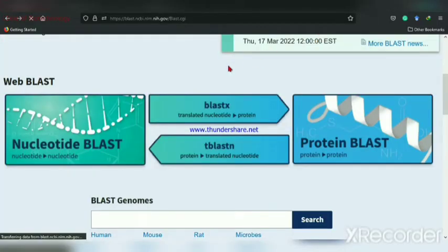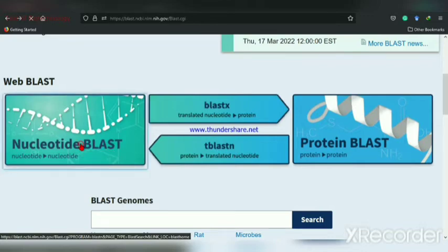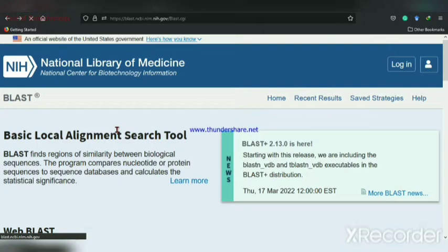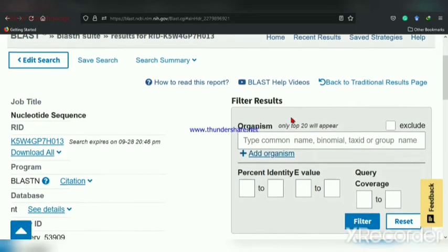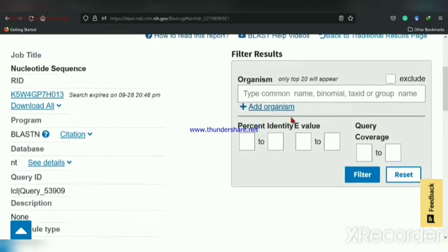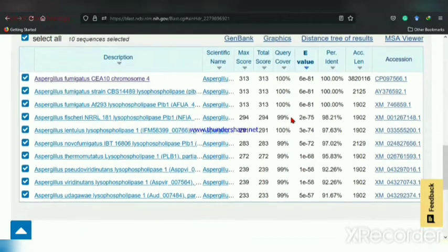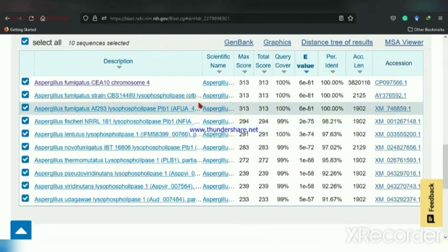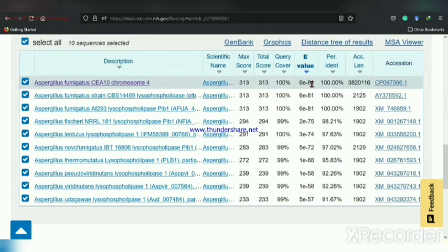To check your primer, you can BLAST it using nucleotide BLAST. After running the BLAST, you can check the accession number, E-value, and also query coverage. Generally, the query coverage should be 100%. Your designed primer should hit the exact sequence of that particular species.